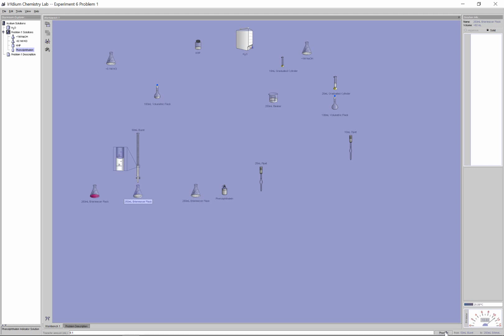Should be getting really close. I'm looking for the faintest pink color. You don't want to accidentally overshoot this one here. And let's see if I do this accurately here. You should be able to see the pink color steadily appear. You can imagine trying to do this kind of really small interval here from the start. That's why we do the first one just sort of approximately what it's going to be, and then this one afterwards. So this one here, nope, doesn't look like it's changing color.